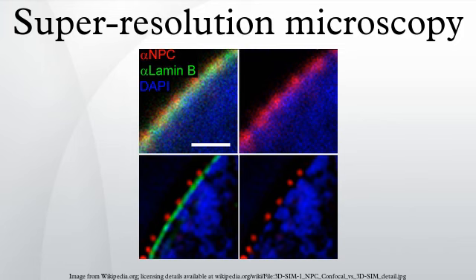Subsequently, the lateral position of the individual particle or molecule is determined using SPDM, achieving a precision of a few nanometers. As a biological application in the 3D dual-color mode, the spatial arrangement of HER2/neu and HER3 clusters was achieved. The positions in all 3 directions of the protein clusters could be determined with an accuracy of about 25 nanometers.